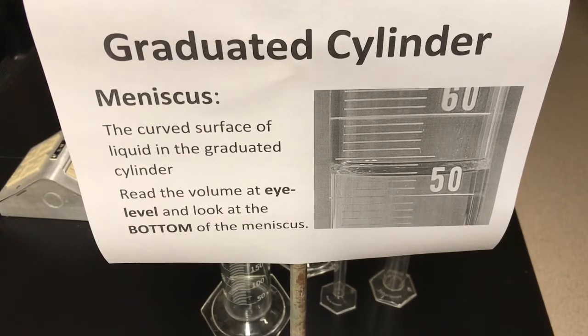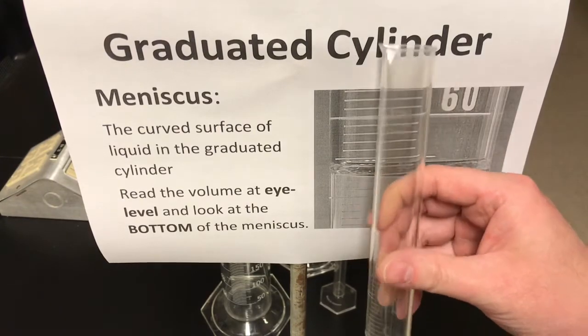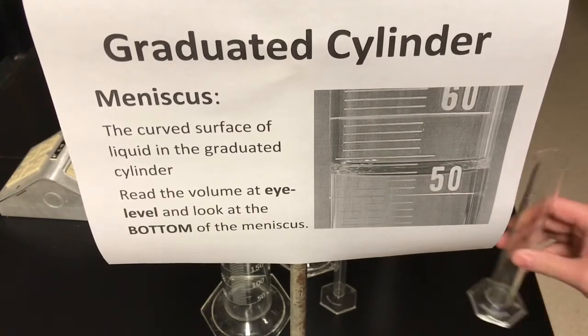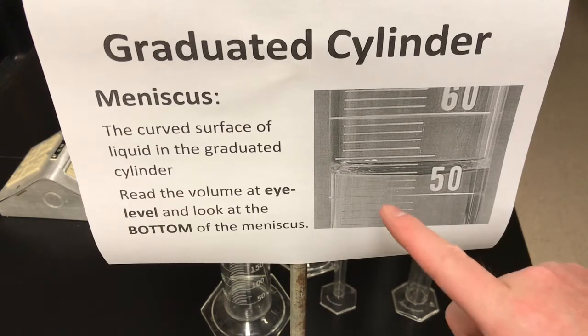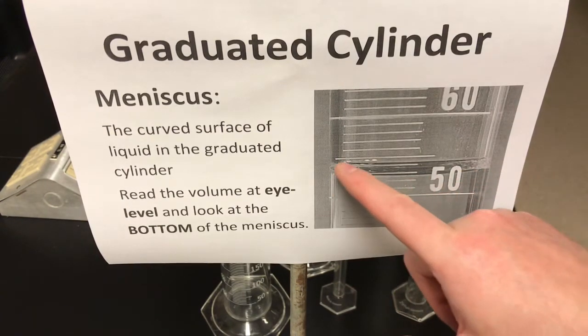In Grade 11, chemistry will look at why the liquid usually forms that curved surface. But it doesn't always — in a plastic graduated cylinder like this, the meniscus is actually almost flat. So it's not always a very pronounced curve, but in a glass cylinder you can actually see in this picture that it forms a pretty pronounced curved shape.